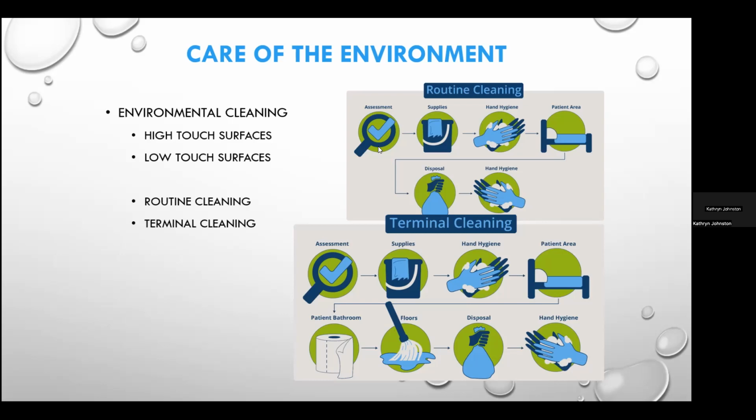It's important to make sure that they have clean cloths available for cleaning. Their cleaning solutions, their detergents, should be diluted correctly. And if they are using disinfectants to disinfect the areas after they have cleaned the areas, it's important that those are also diluted correctly. And then, as part of the first steps, they would restock those missing or low stock supplies. The person performing the environmental cleaning should perform hand hygiene and put on gloves.